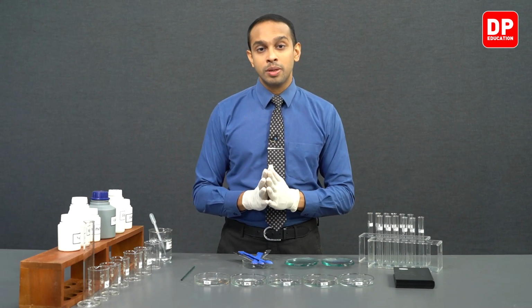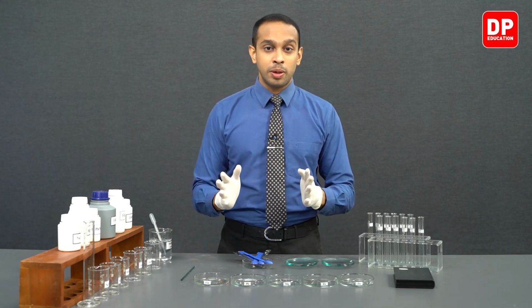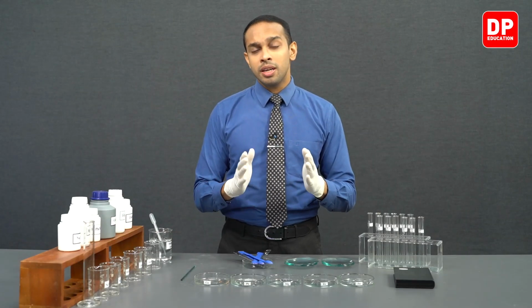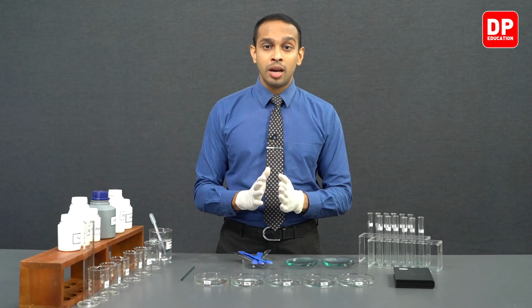But before we move on to our experiment, let's try and understand what is actually going to happen in this experiment, or experiment number 39. So we are trying our best to identify in which regions of the electrochemical series each of these metals are going to appear. The electrochemical series has elements arranged based on their reduction potential. Now students, the more negative the reduction potential of an element is, that element is more likely to get oxidized.